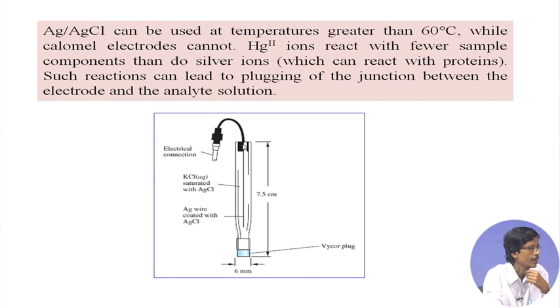So, you have the electrical connection. These electrodes basically we buy, like that of your pH meter. The pH meter is not that one only, you have to buy the corresponding electrodes, and if it is a combination electrode you can have everything together, you just insert only one part, because the electrode itself is not only an electrode, but a combination of several electrodes.